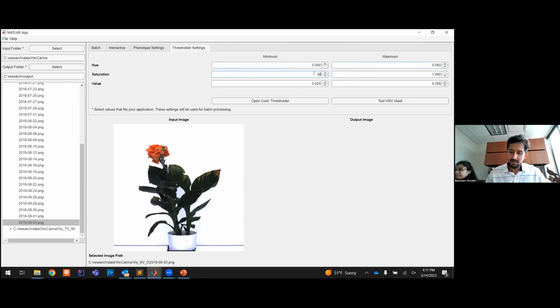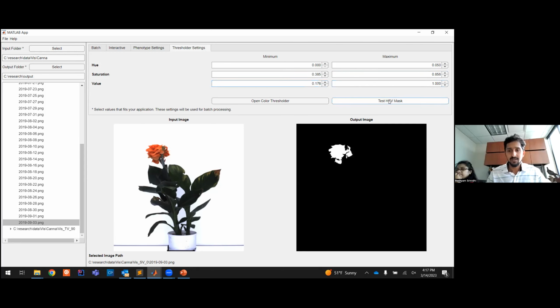Bear with me. So I'm going to test it. So pretty okay, fine. Of course, I can perfect this for other images if I want to, but I'm just going to run it on everything.